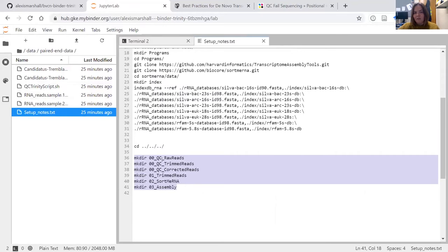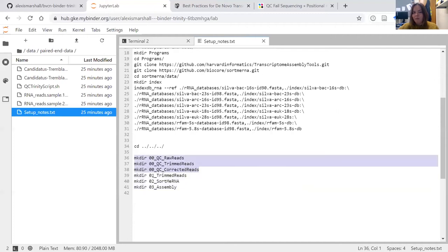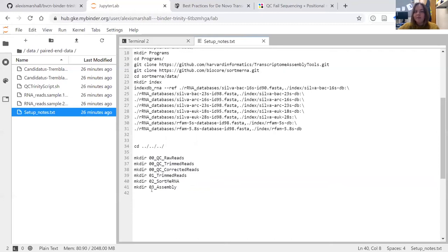Once that's finished, we change directory back to where sample reads are located and make a few new directories that we use with the QC Trinity script - these are all output directories. This is a personal preference that keeps everything tidy, because many of the programs run today produce a lot of output files: log files, FASTQ files, and the actual output files we're interested in. When you come back to your data in two or three months, it helps you work out where things are and which step corresponds to which stage of the pipeline.